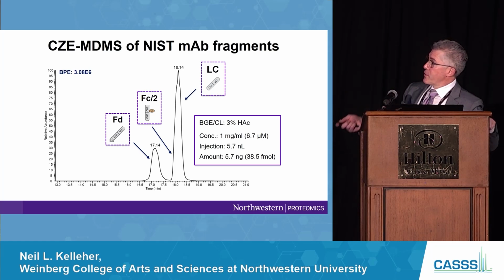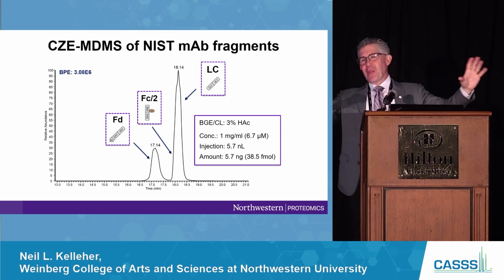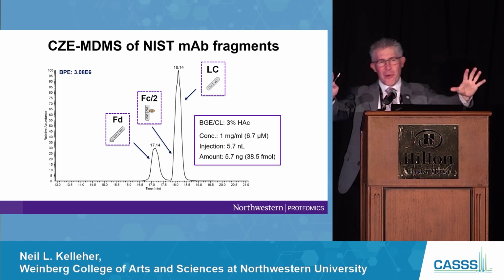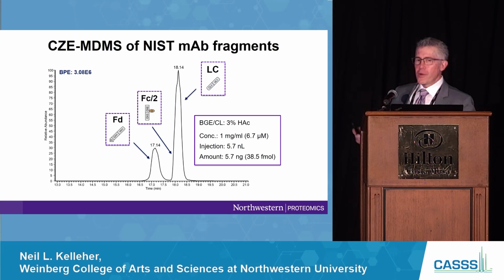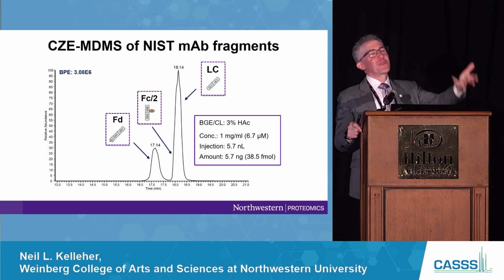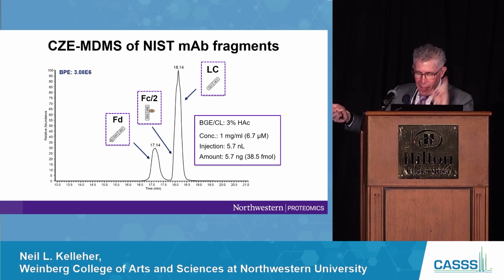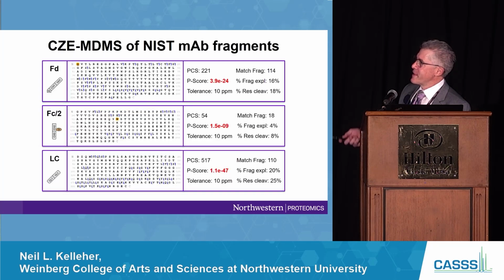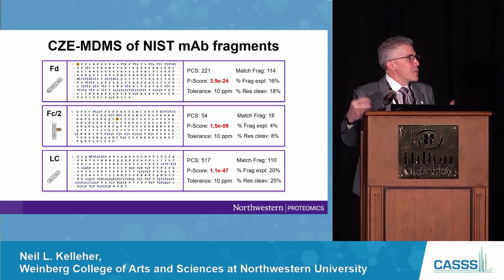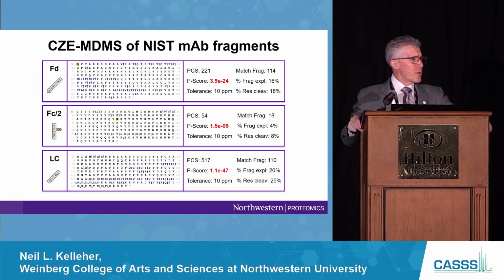Yeah, so this is CE, capillary electrophoresis, so you might not be impressed with 30 seconds, but it's good for mass spec analysis. Don't storm the stage. I'm sure Kevin could have done better, but we'll blame Kevin. I just threw Kevin under the bus. But I think he actually detuned it for exactly your reason. He was trying to get more time to get more fragment ions, because we get this criticism a lot. This is also 2020.